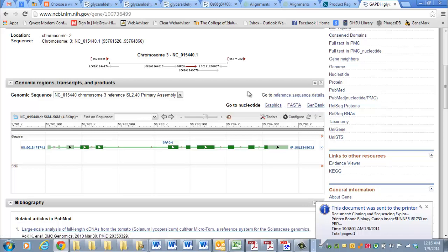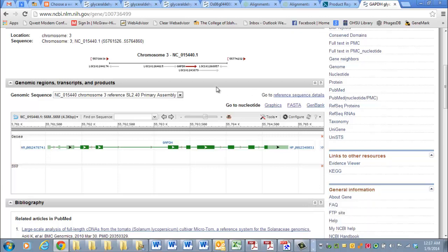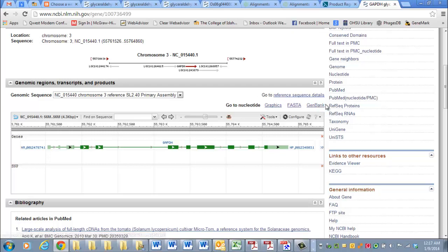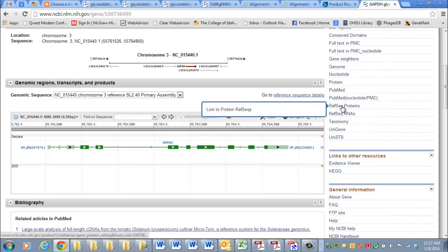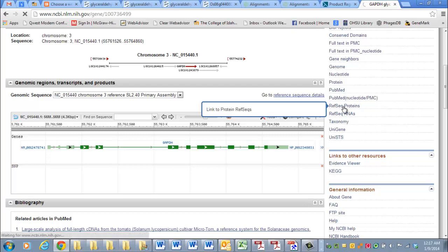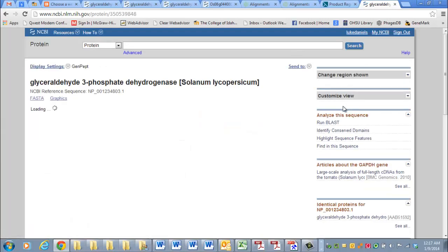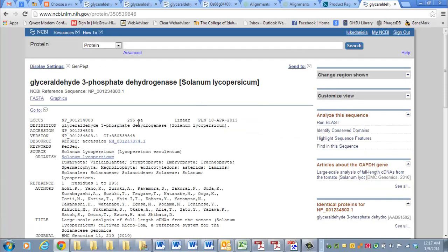But what if we wanted the predicted protein from this gene? Instead of clicking this FASTA, you can go over here to this box that says RefSeq Proteins, which stands for Reference Sequence Proteins. If I click on that, it's going to bring up another page.